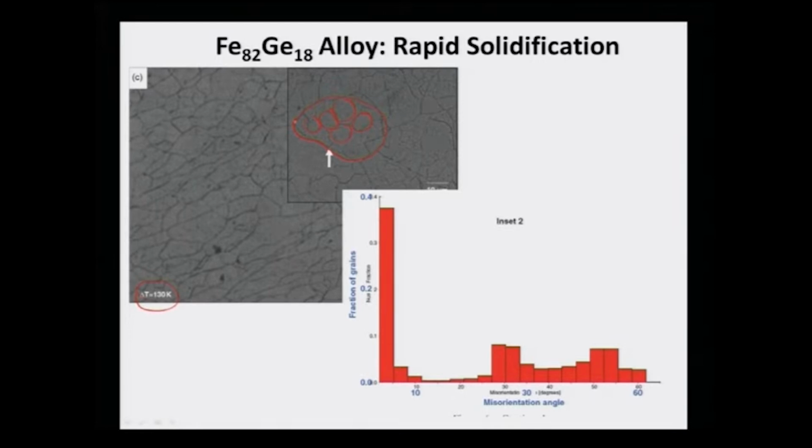So, by looking at this optical micrograph, any avid reader of this microstructure, whoever has a good understanding of the microstructure, will tell that these grains are actually formed by some means from the big grains. Therefore, the boundaries of these grains will be small angle grain boundaries, and these big grain boundaries will be large high angle grain boundaries. This is what we find in the case of EBSD.